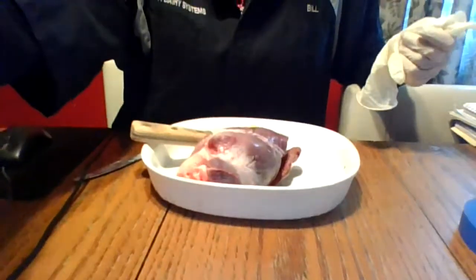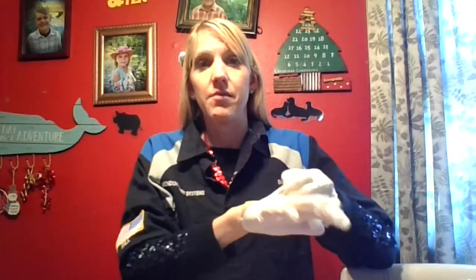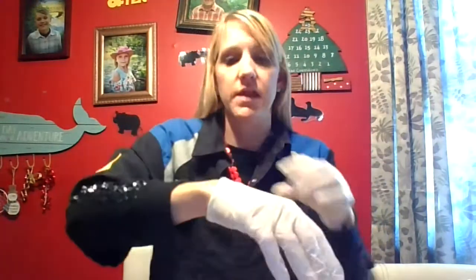Hi! Guess what we're doing today — we're wearing old clothes like this, okay? And we are going to dissect a heart. I'm wearing gloves because I have a massive cut on my hand — I made a huge gash taking a scarecrow off my porch and could see the connective tissue underneath. So you should probably put goggles on, put your hair in a ponytail, all that jazz.